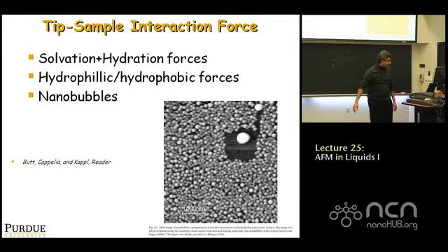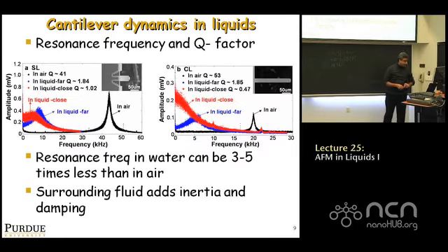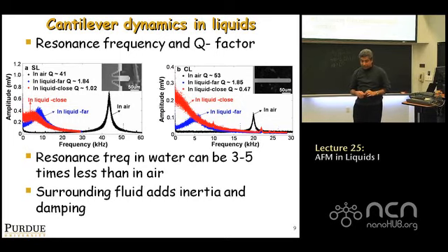Okay, so these are some of the forces we need to worry about in liquids. Each one of these forces would take an entire lecture to go into details. Hydration and solvation forces would take possibly even a whole month to really understand in full detail. Okay, but I'm just making you aware. Now let's talk a little bit about what happens to the cantilevers as you put them into liquids.